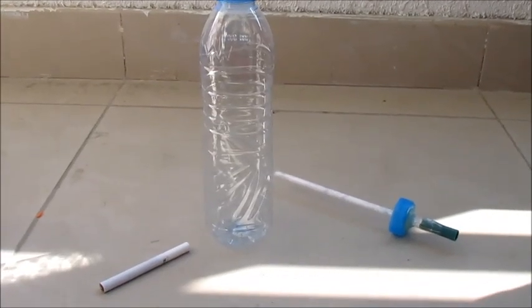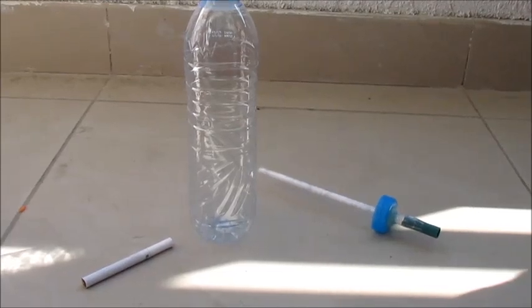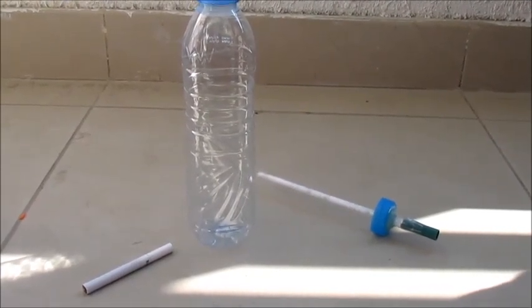This activity demonstrates some of the harmful substances in cigarette smoke. You need to do it outside or in a fume cupboard to make sure that you don't breathe in the smoke.